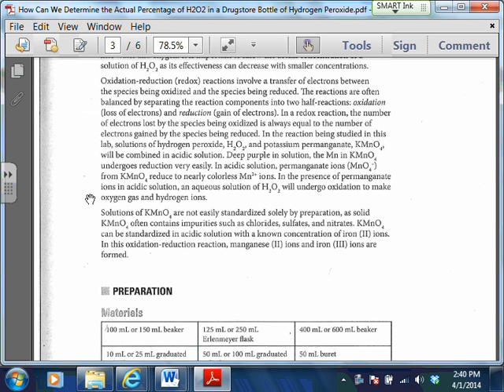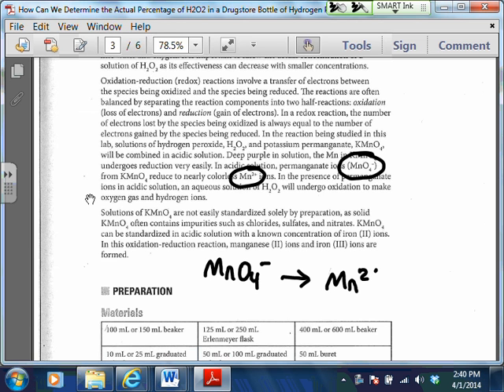And then it's saying you need to write the balanced half reaction for the reduction of permanganate. Well, they kind of help you out with that too. I don't think that the AP exam, definitely not on my test, would expect you to just know this off the top of your head. But now you'll know it because we're talking about it in the lab. When permanganate reduces, it gets reduced down to Mn2+, okay? So that's going to be your first balanced half reaction, MnO4 minus going to Mn2+, okay? So they want you to write the balanced half reaction for that.